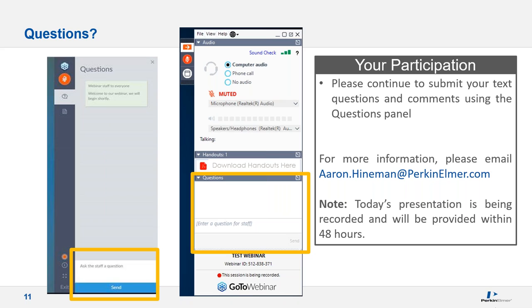Someone said, when running samples that have high TDS, we often deal with the plasma extinguishing due to droplets developing on our injector tip. Any suggestions or further comments on optimization to prevent this? Yeah, a couple things. First, an argon humidifier will definitely help. Also, a little longer rinse between samples will help clean the tip a little more. Another thing, which I learned from one of my coworkers over in the Netherlands: he finds a sapphire injector works very well for high dissolved solid samples because the interior of a sapphire injector is smoother, with fewer nucleation sites. When I've switched to that, I have seen it work much better than a typical alumina injector, for example. So that's an option also.